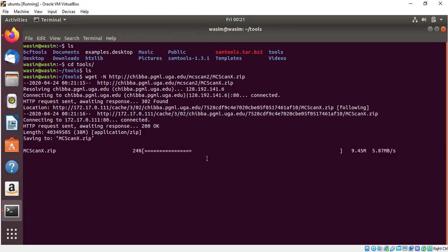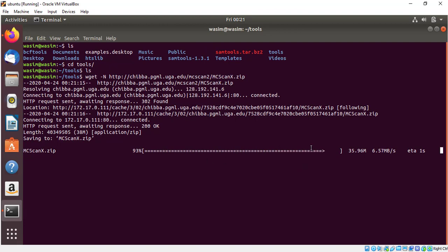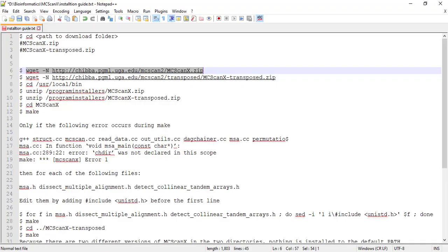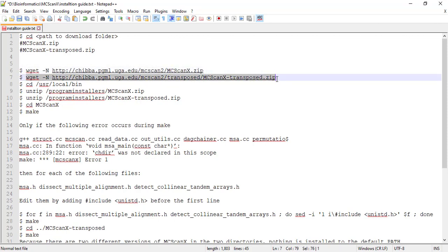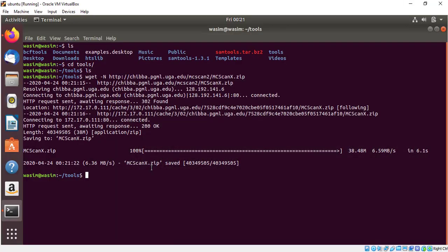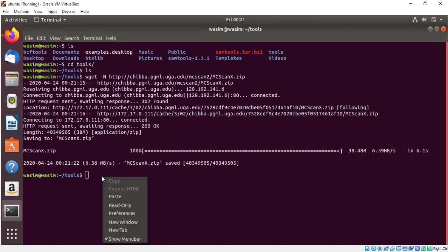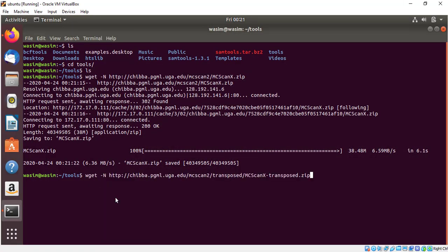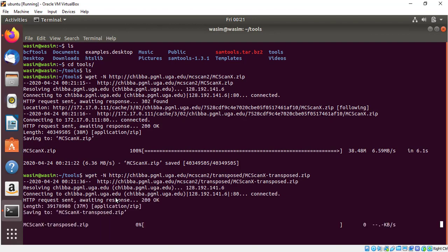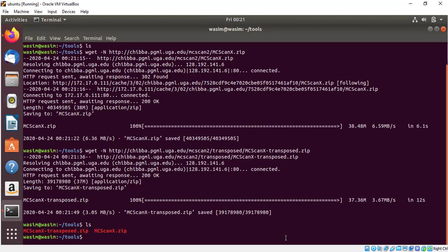This will download MCSCANX. You will see the progress bar here. After that download MCSCANX Transposed zip and press enter. Wait for download. Now you can see our two zip files, MCSCANX and MCSCANX Transposed. Both are downloaded.